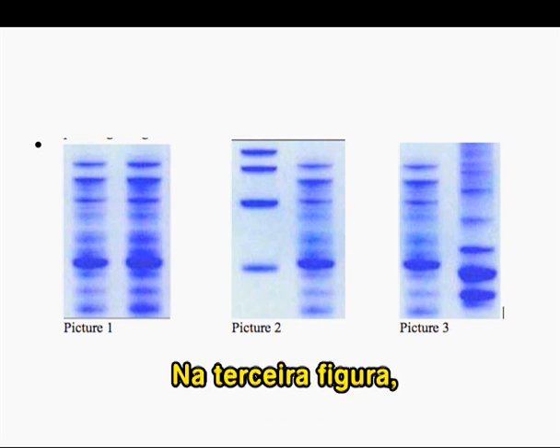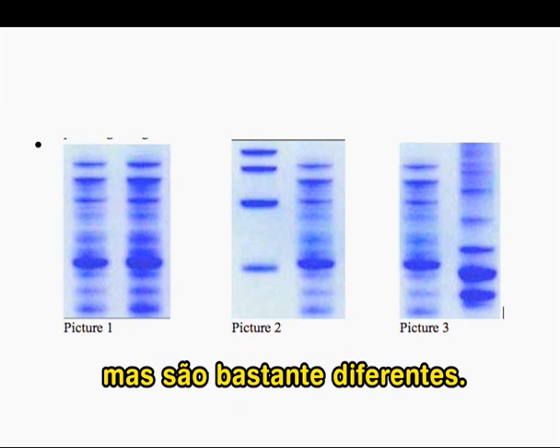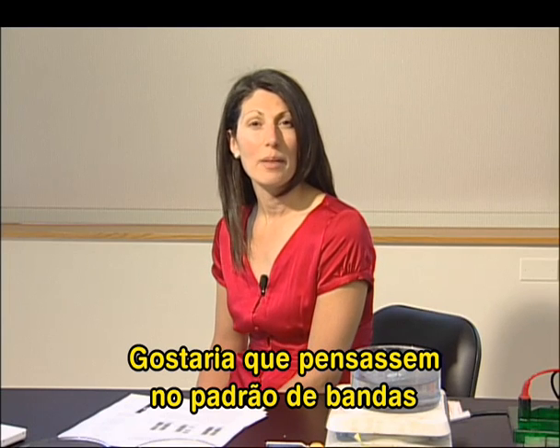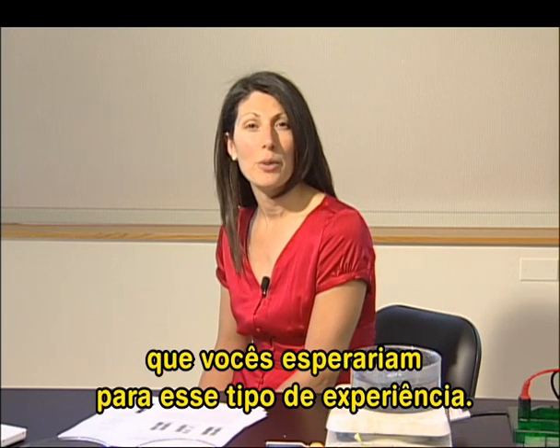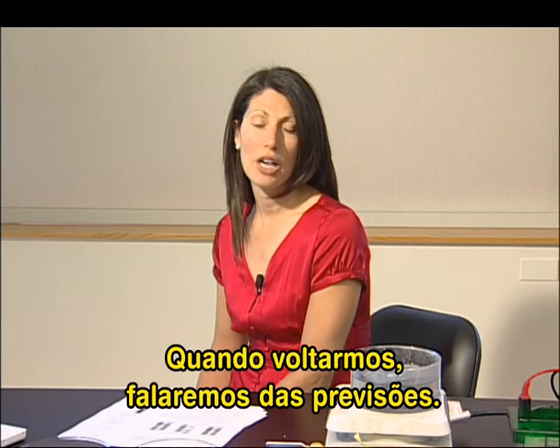And in the third picture, it looks like there are many proteins for both types of peas, but they're quite different from one another. So I'd like you to take some time and think about the kind of banding pattern you might expect for this type of an experiment, and then come back and we'll talk about your predictions.